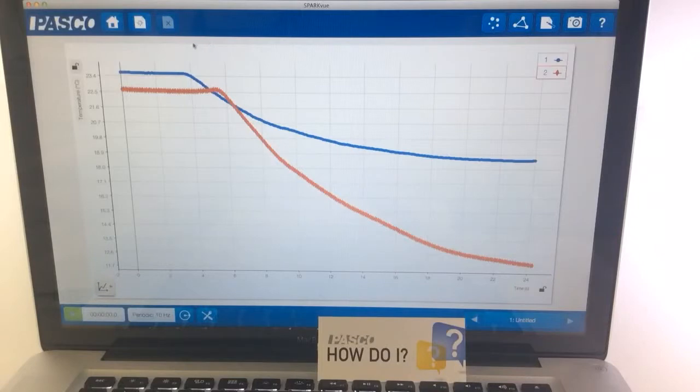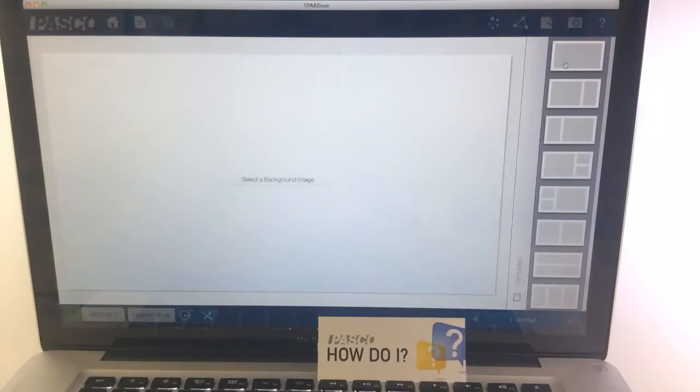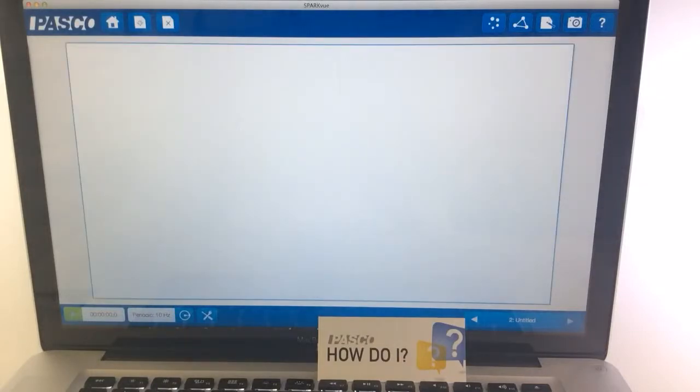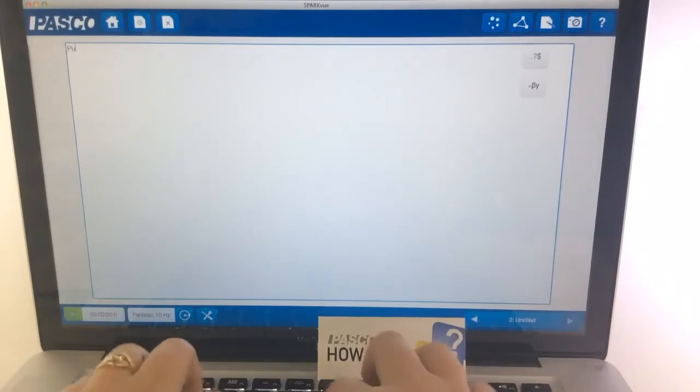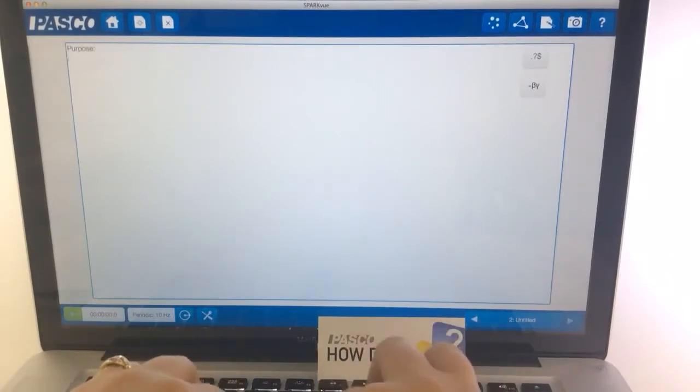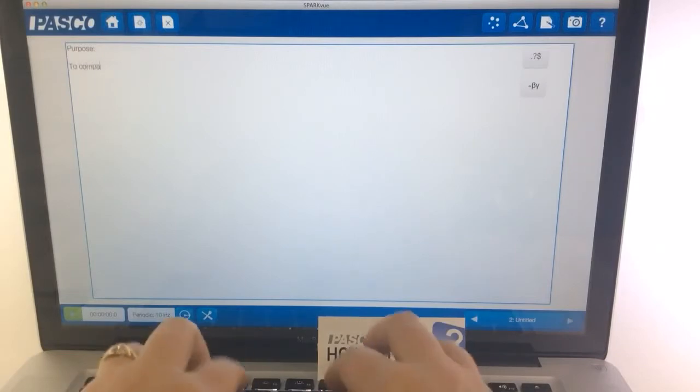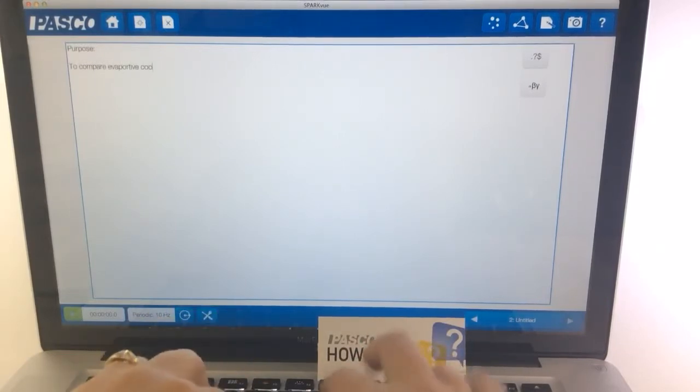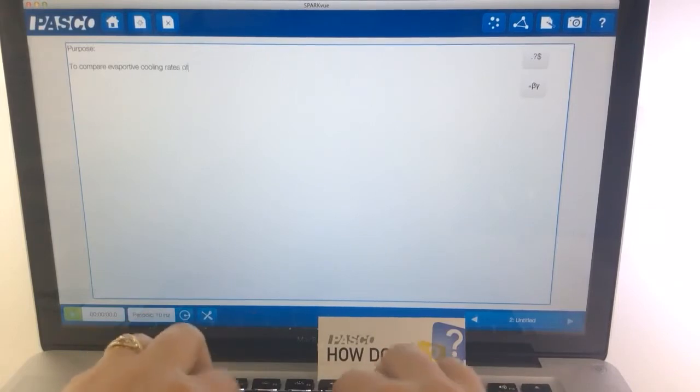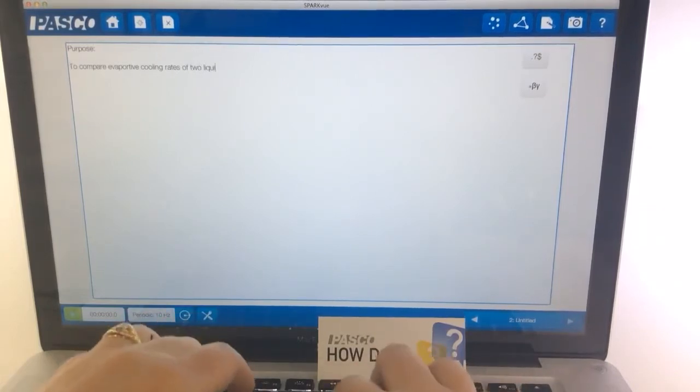Students can also add a page by clicking next to the home icon, and when they select a template, they can make a page be a text box. So here they could type in, for example, what the purpose of their lab was to compare evaporative cooling rates of two liquids.